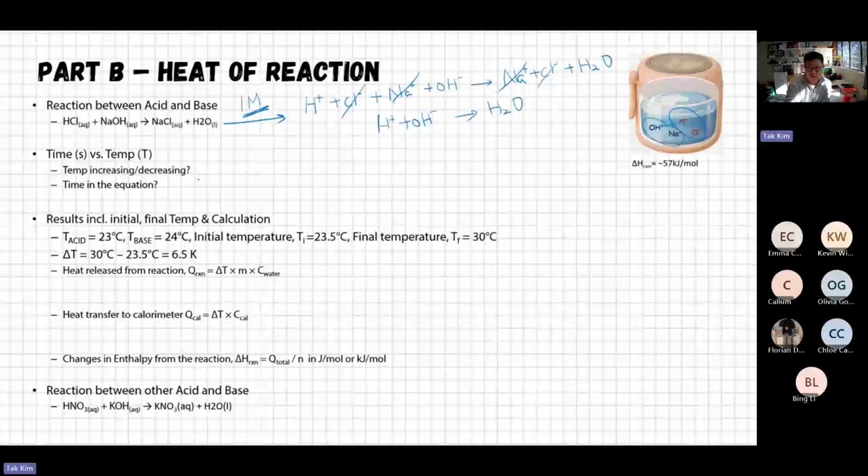And I'm sure you also saw the temperature going up compared to the initial temperature of each one. Because of that, you can already tell it is going to be an exothermic reaction. Depending on how you did it and how you mixed, some of you might have, let's call this one temperature and this one time, started at a higher temperature and then the temperature went down slowly.